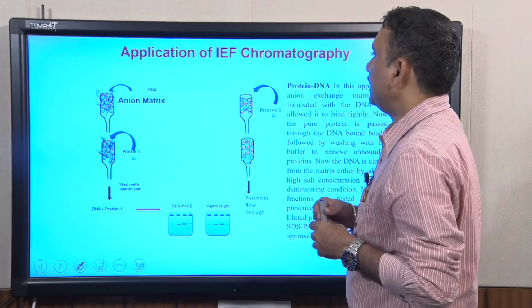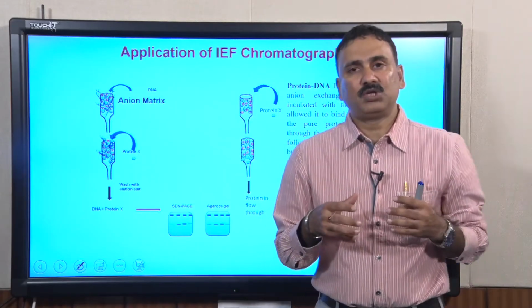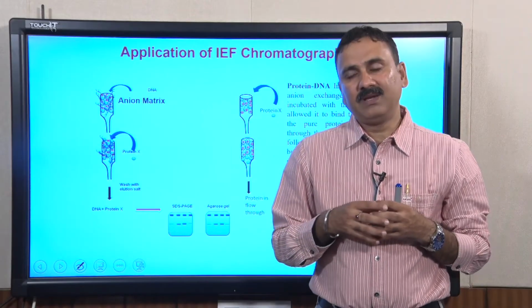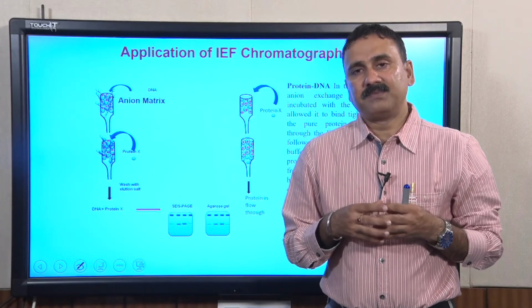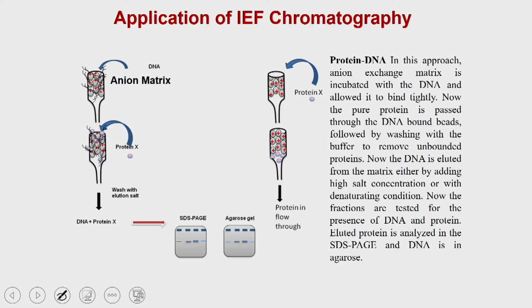The first application we are going to discuss is the utilization of ion exchange chromatography in developing different types of assays or studying the interaction between two biomolecules.